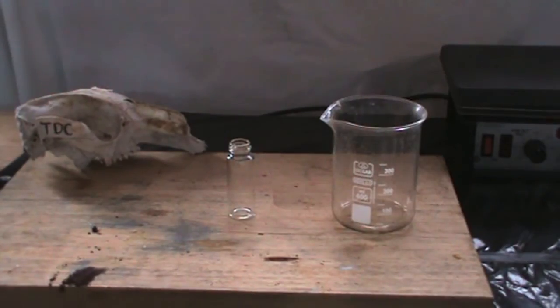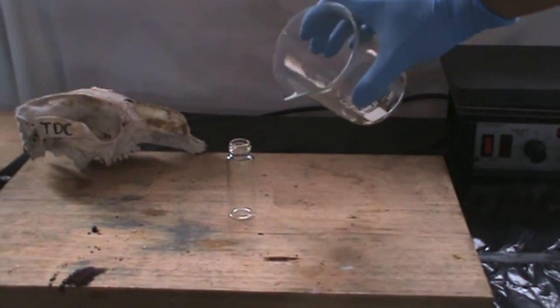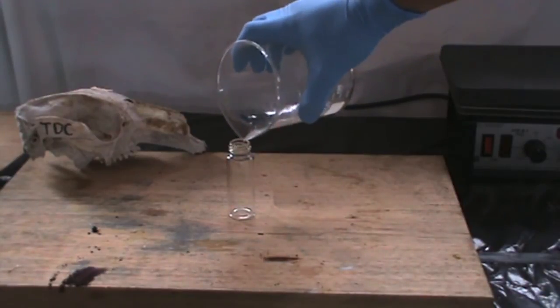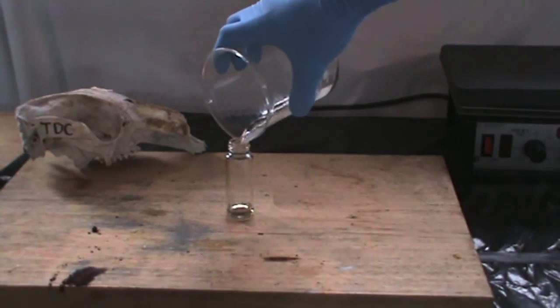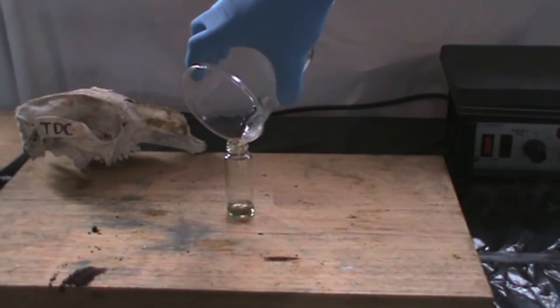Remove the beaker from the hot plate and let it cool. Pour the contents into a glass vial. We can also see the liquid is quite viscous. Concentrated sulfuric acid is a viscous liquid.